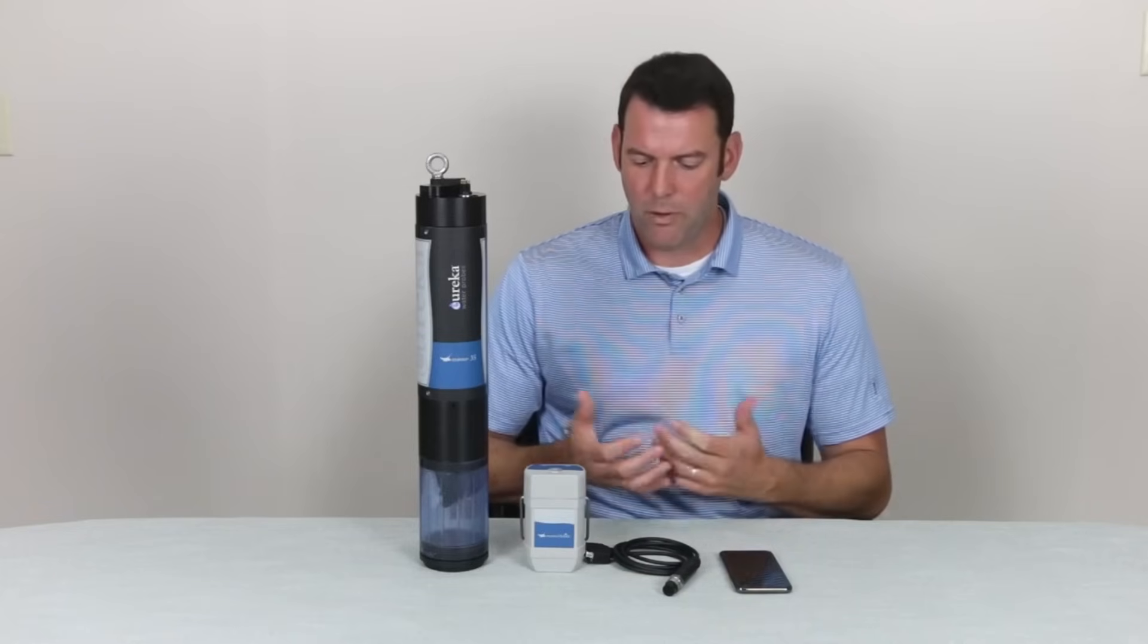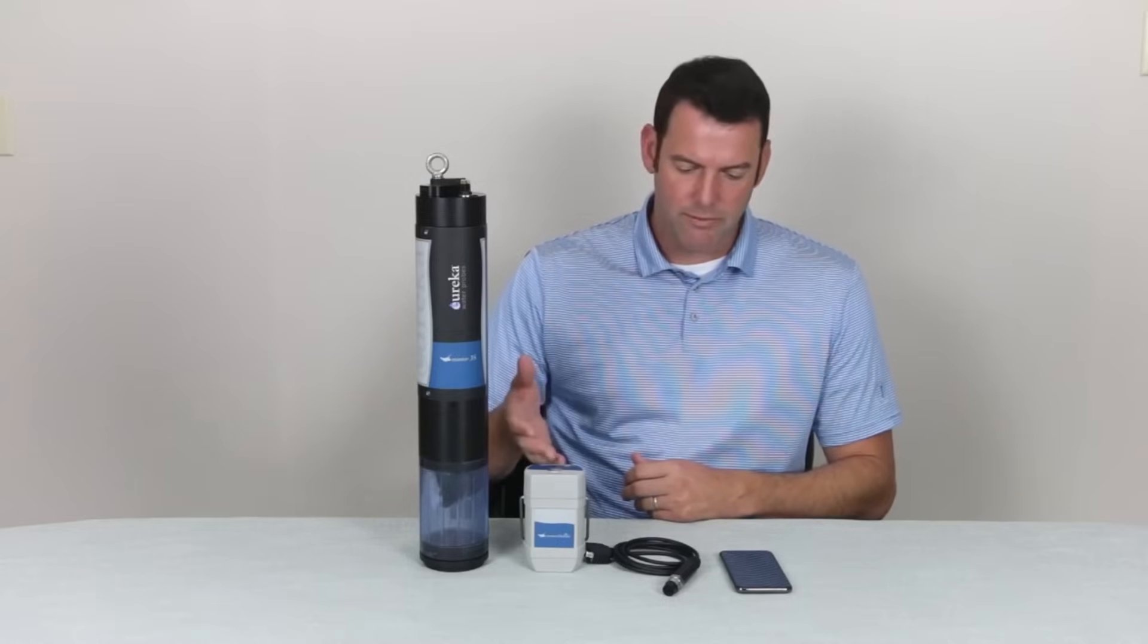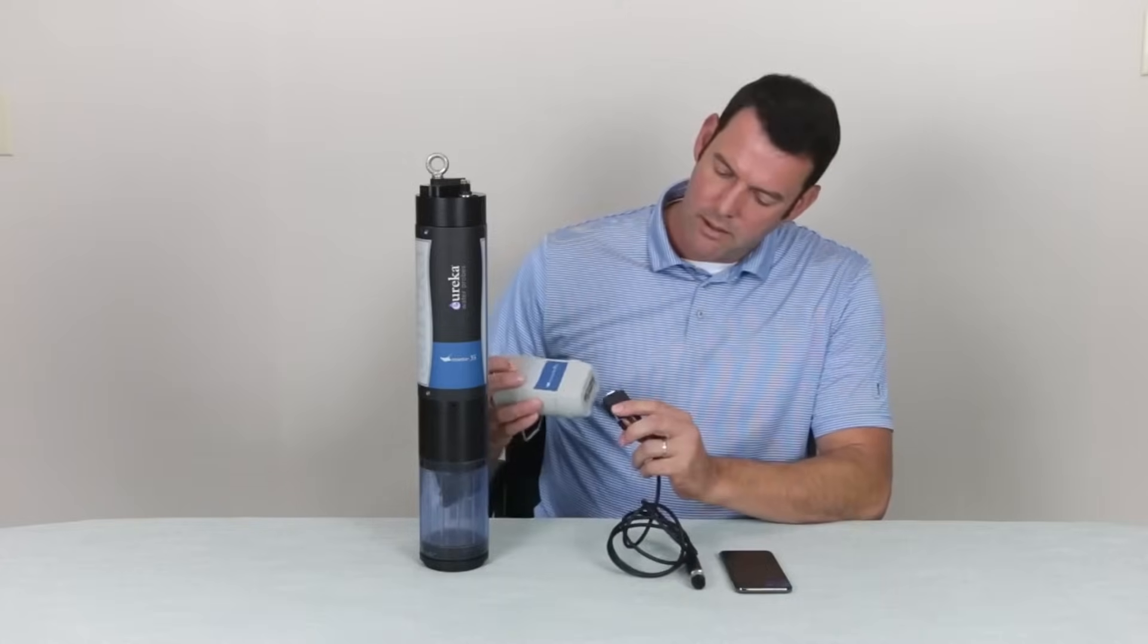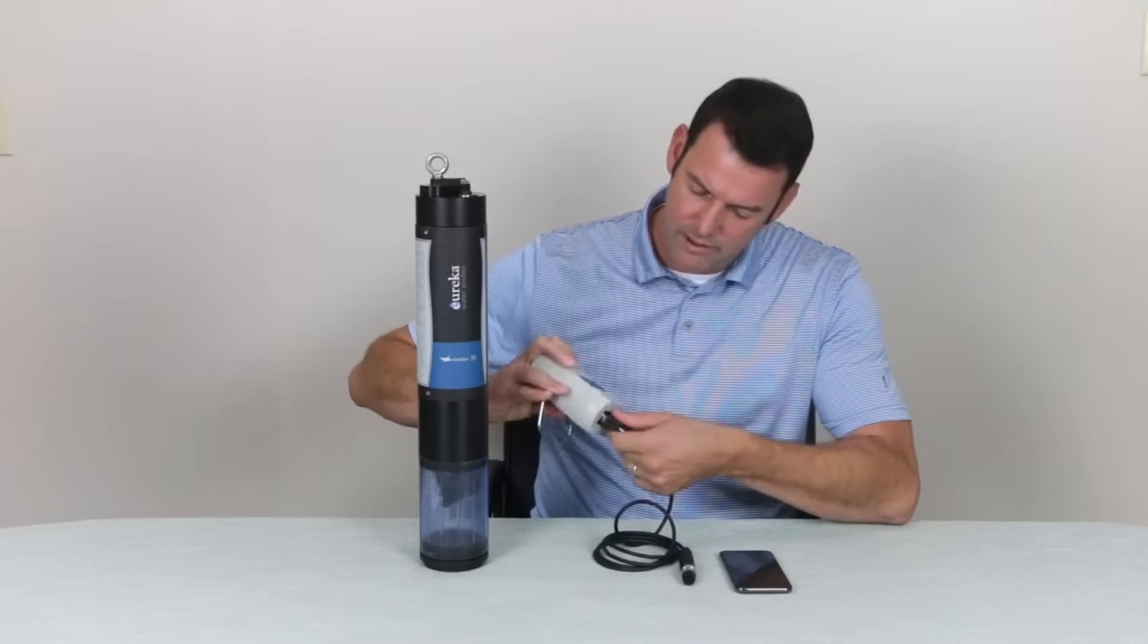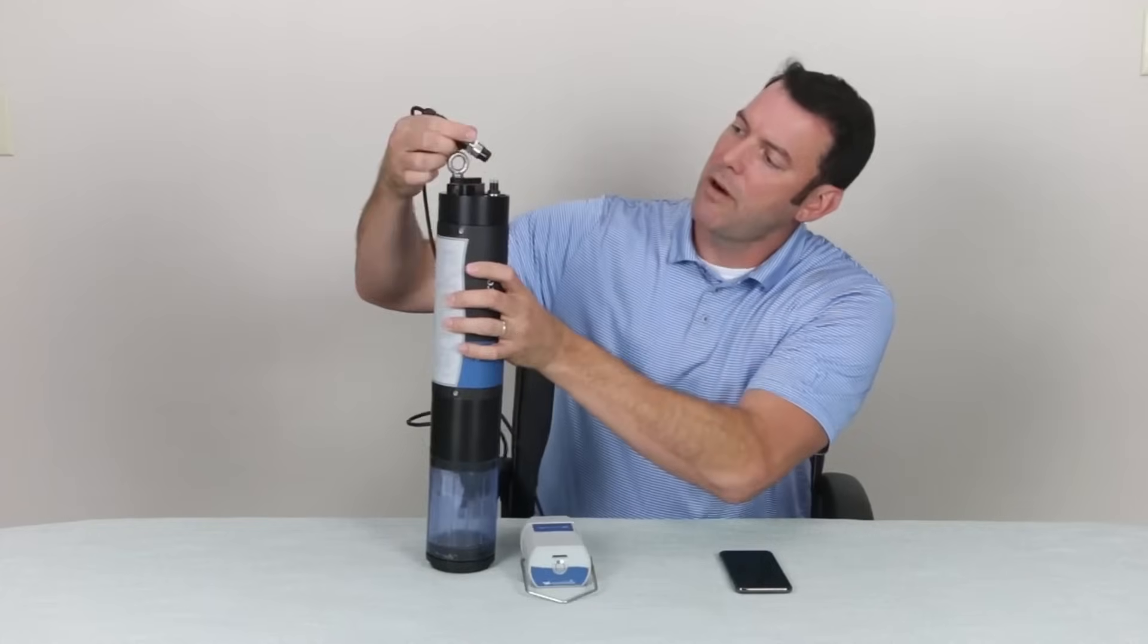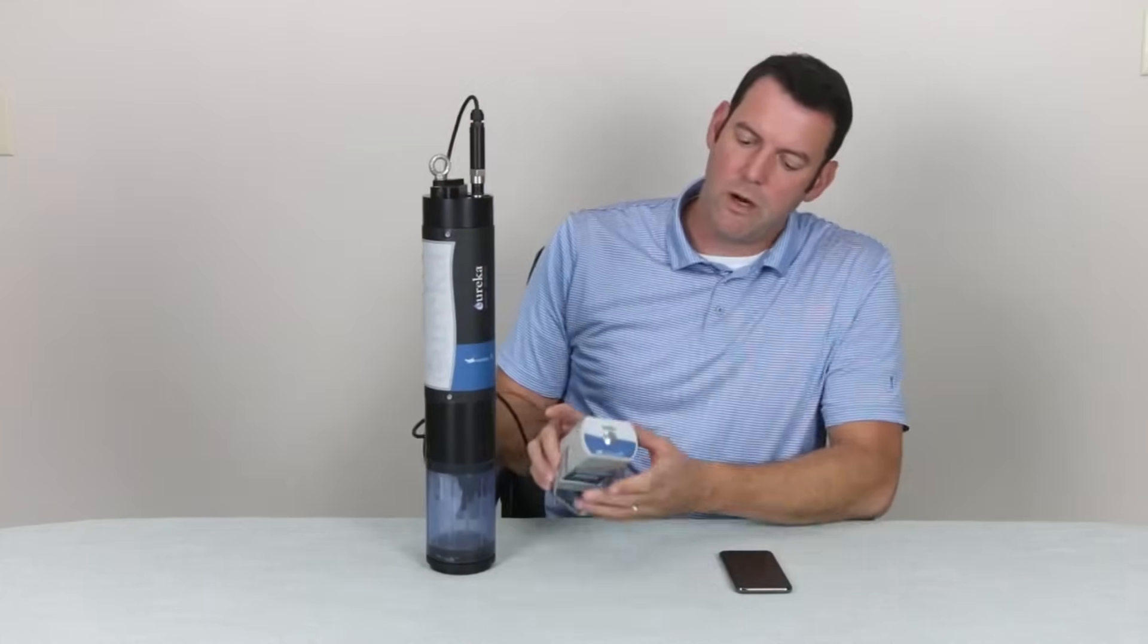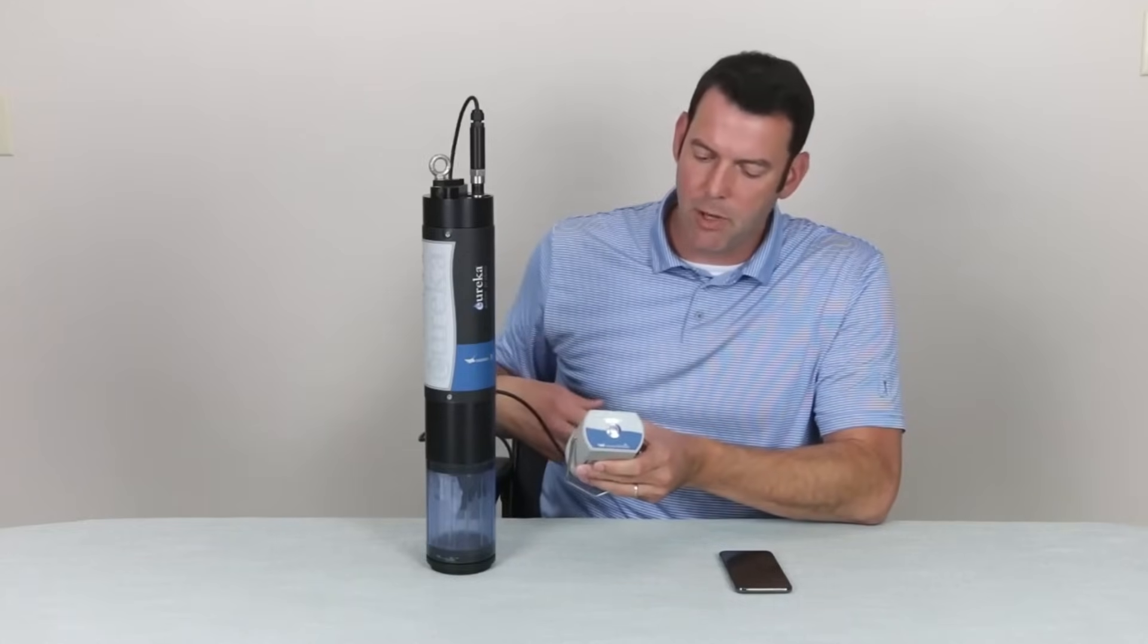At this point we're going to connect the Multi-Probe to the Manta Mobile device using our cable. We'll take our 9-pin end, connect that to our Manta Mobile device, and connect our 6-pin to the top of our Manta Multi-Probe. Then we're going to power it on using the power button here on the top of our Manta Mobile.